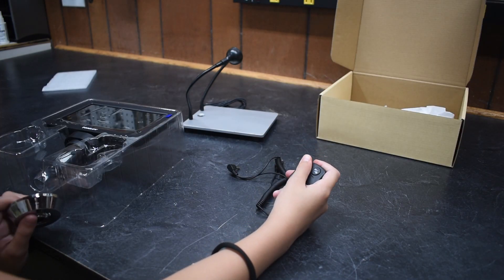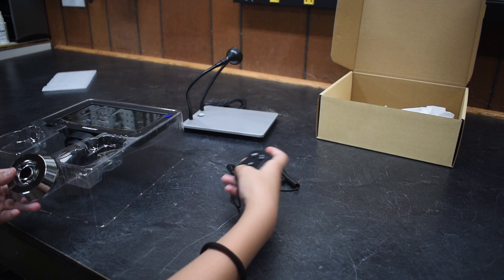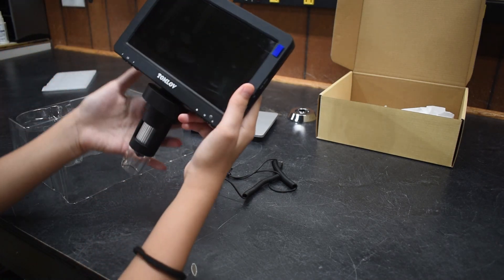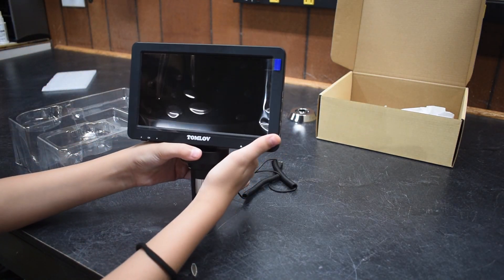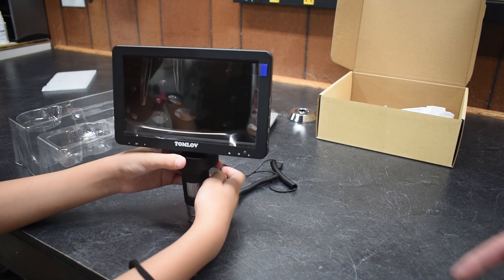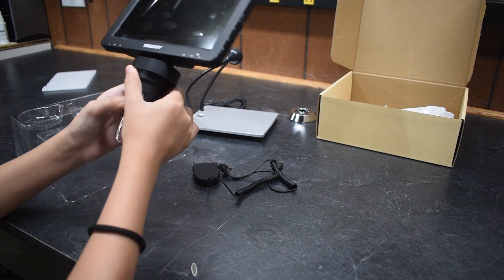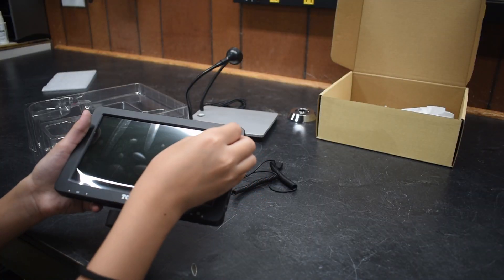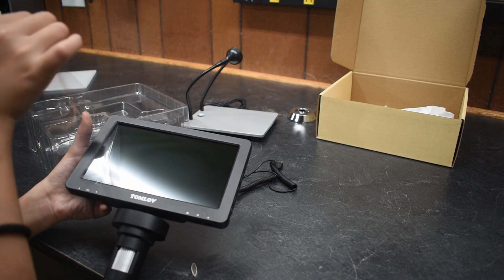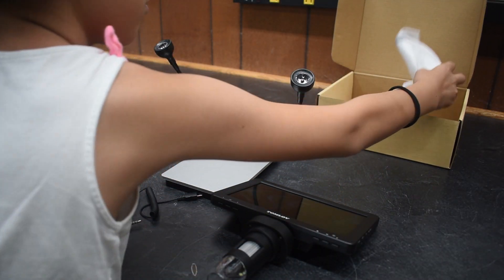This is the remote control. And this... I don't know. The TV! Where you can watch anything like Disney Plus! So this must be the microscope part down here, so be careful with that. What is this? What is this? Anti-san.